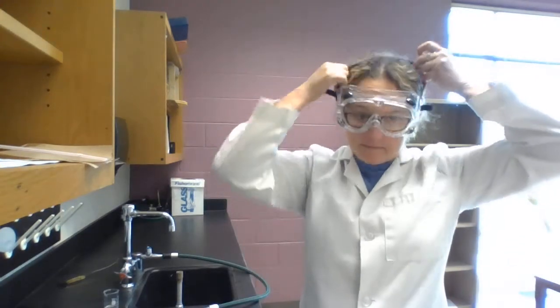Okay, so today we're going to do a demonstration on a synthesis reaction. So I have my hair pulled back. I'm going to put on my goggles. So if you look at your synthesis reaction activity that I've posted for you, the first one we're going to do is I have a strip of magnesium.